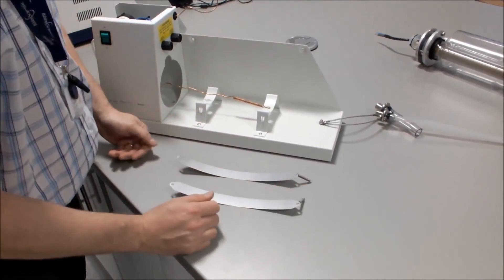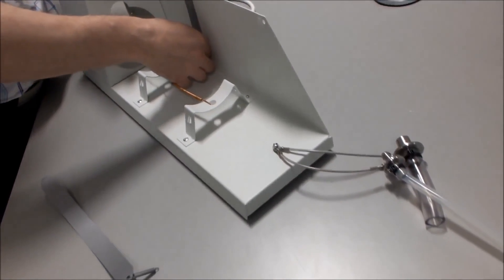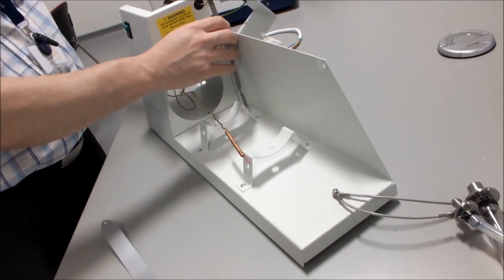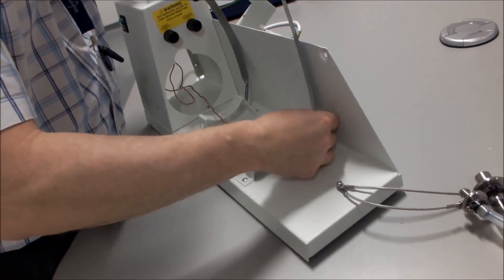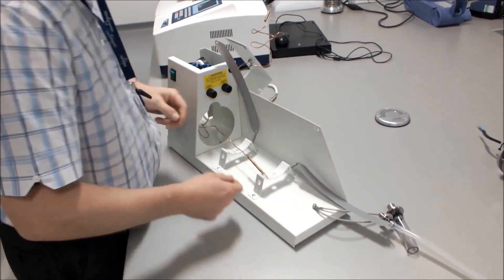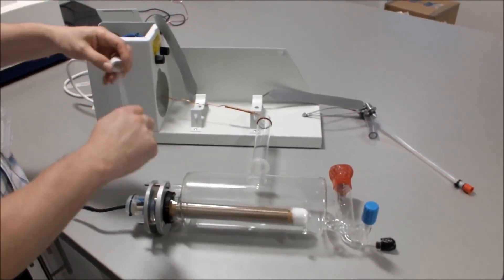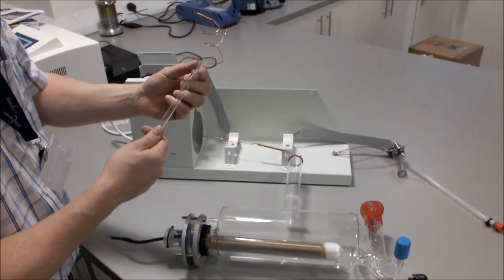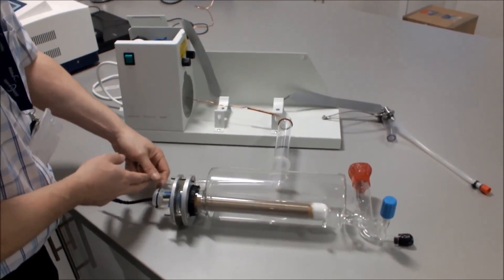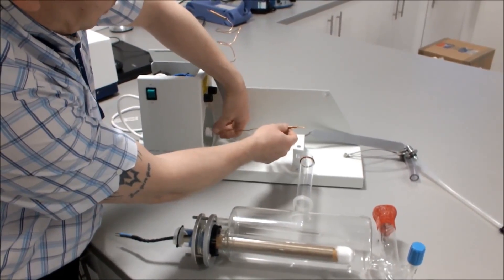We then take our two straps from the gasket kit — two metal straps with a spring on one end — and attach the spring to the back hook on the cradle. We take out our boiler thermostat tube. It comes with a seal; place the seal approximately 30mm from the end of the tube. Place that into the boiler and fit the white screw cap onto your boiler thermostat.